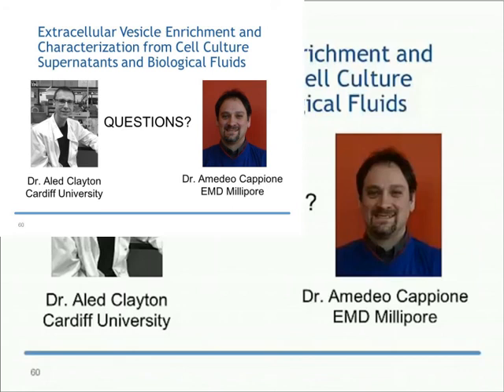Just to piggyback on that thought, I can attest to Dr. Clayton's concerns regarding the use of these commercially available exosome-depleted serums and their incompatibility with certain downstream applications. I've seen this firsthand. So if this is a way that you would like to go, I would recommend that you first validate whether this is going to have any impact on your downstream application, whatever it may be, and then perhaps work with the company to understand what is being used for the depletion method.